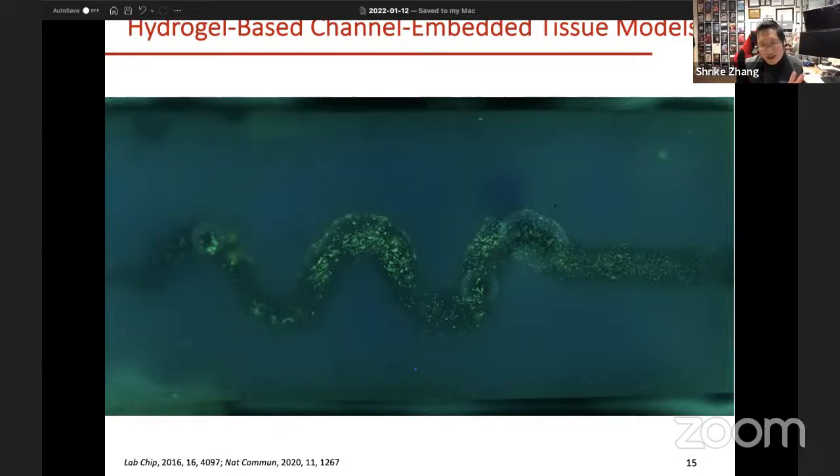One is that these hydrogel matrices can be expensive depending on what type of hydrogel you use. And the second is that since these hydrogels are aqueous and degrade fast, you pretty much have to use these printed tissue models right away after bioprinting. You can't really store them for long, right? So can you design some other system that can simultaneously solve these two challenges associated with conventional sacrificially bioprinted hydrogel-based microtissue models?